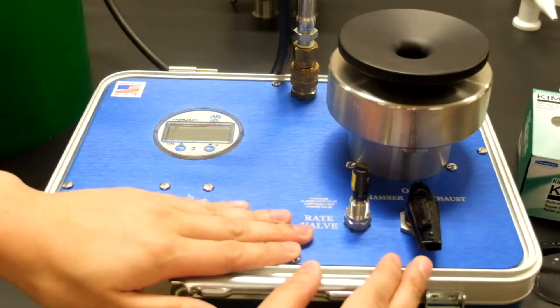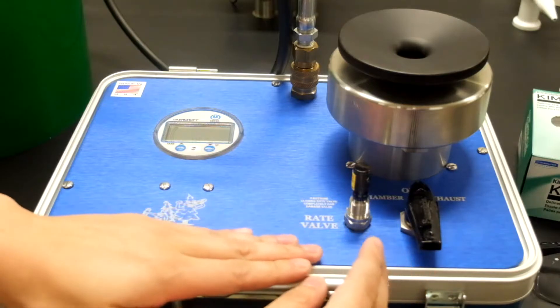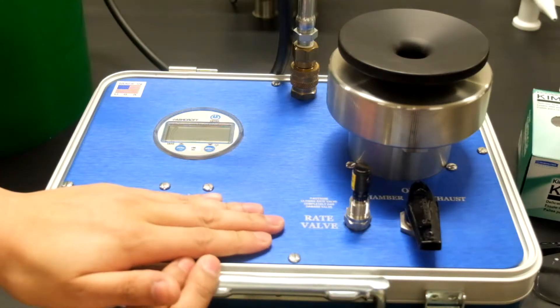Over here at the bottom right we have two valves. The valve on the left is the rate valve which adjusts the rate of nitrogen gas pressurizing the chamber.